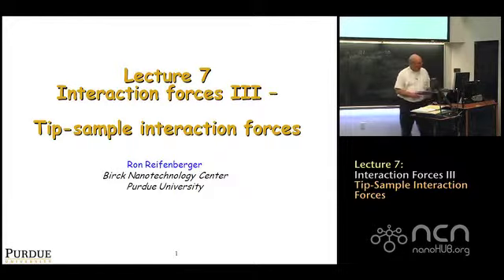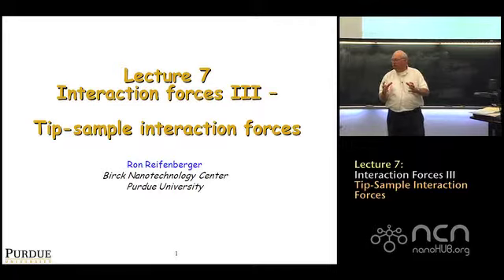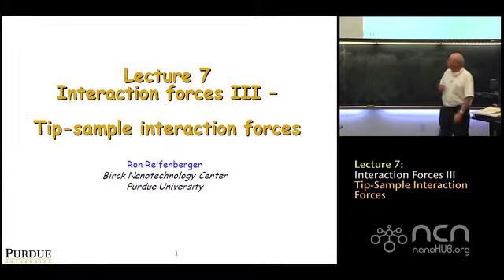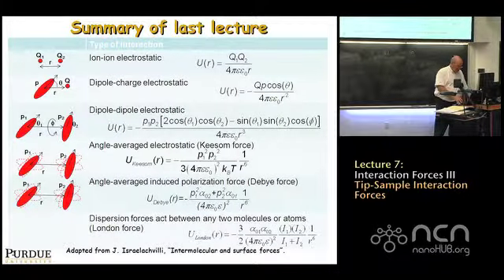So now we're taking the atom-molecule interaction forces, going from those models, and applying them to tip-sample interaction forces, right? This just summarizes what we discussed in the last lecture: a pictorial idea of the different forces that could be present between the tip and the substrate.